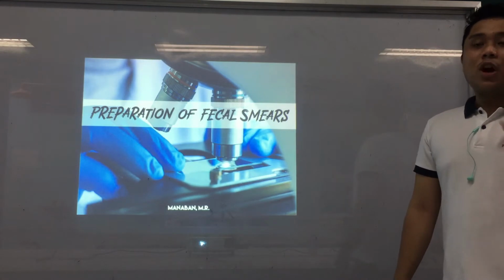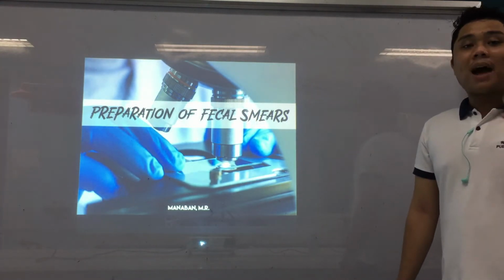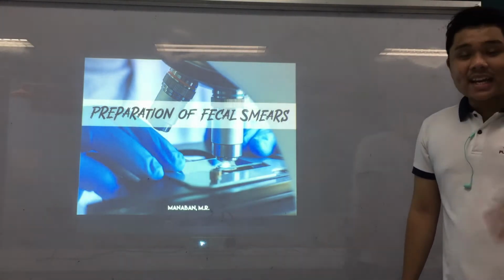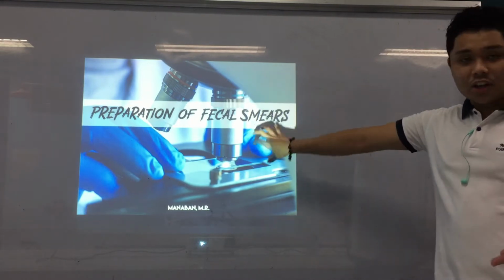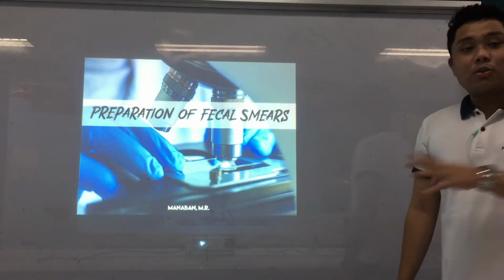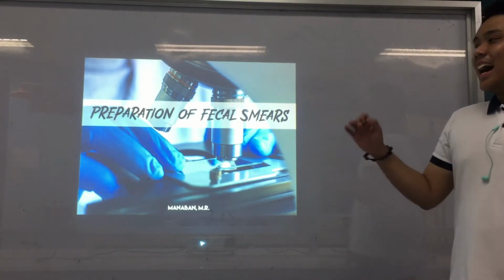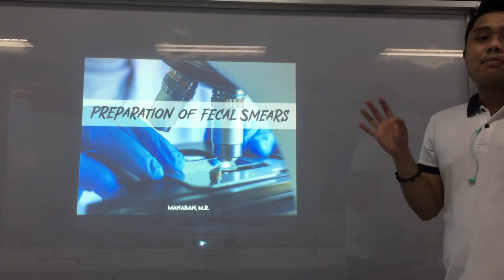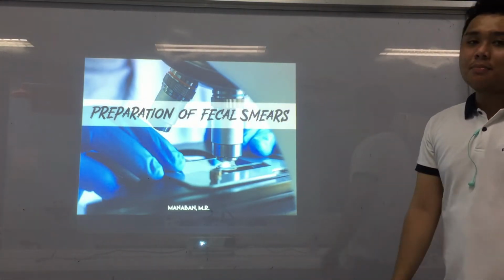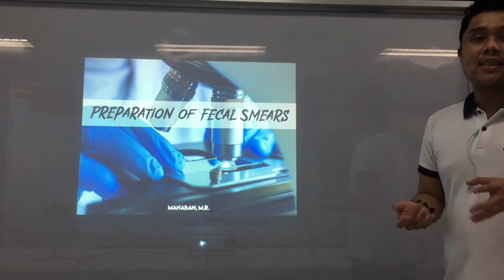Because again, for us to really identify what parasites are present in the stool sample, we need to make slides or smears out of it, all right? And that is what we're going to discuss in this pre-recorded lecture. Again, the main bulk of our job as medtechs in the parasitology lab is to make fecal smears. So, take note, this is just the preparation. So how do we make the smears?